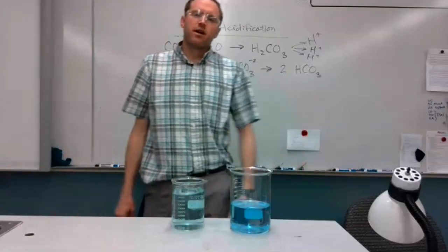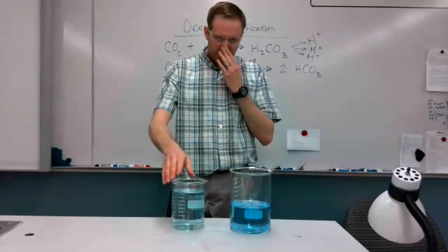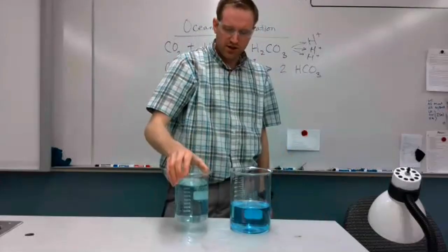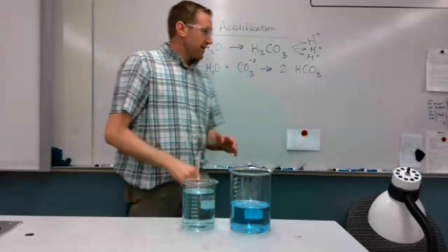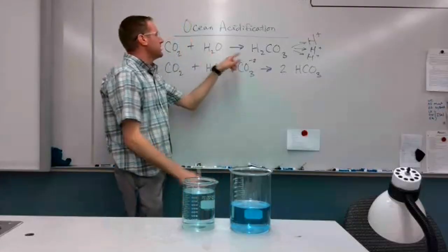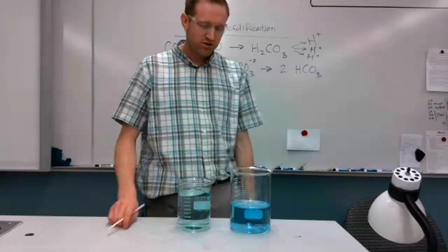All right, I'm going to stop there. But you can see it's kind of turned this greenish color. So that shows it's getting more acidic. There you go, closer to the camera. It's turning that greenish color. All right. So a little bit of carbon dioxide. Again, this reaction here is happening. Carbon dioxide plus water. Carbon dioxide, as I blow through the straw, is making carbonic acid, and the indicator is changing color, telling me it's getting more acidic.